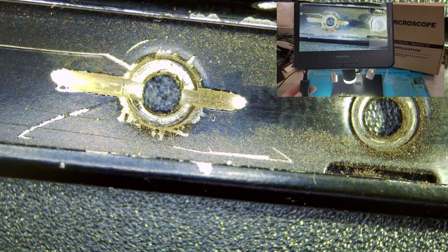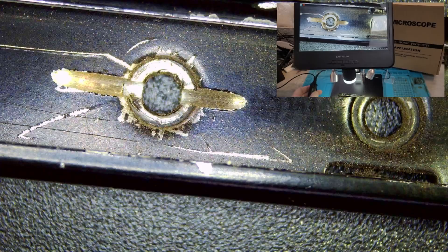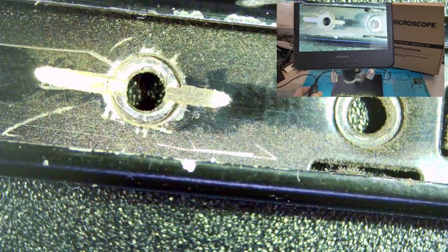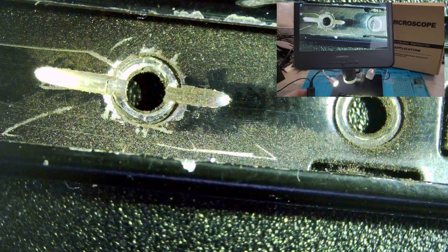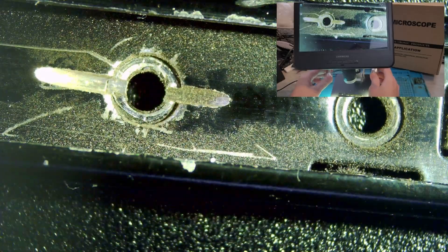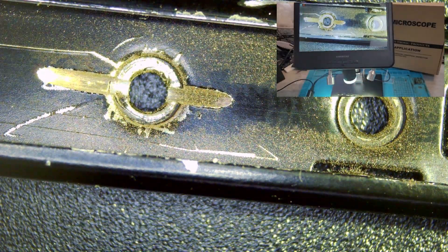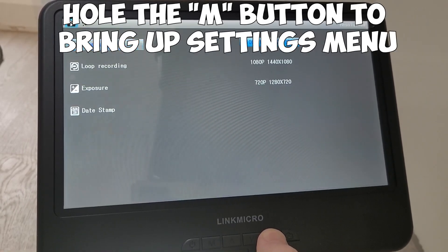It's nice and bright with the LEDs on. On the remote control there are functions to adjust the brightness — you can turn it up or down. On the front, there's a dial to adjust the light on the camera itself; you can turn it to the highest setting or completely off. We'll pop two triple-A batteries into the remote control and go through the functions.